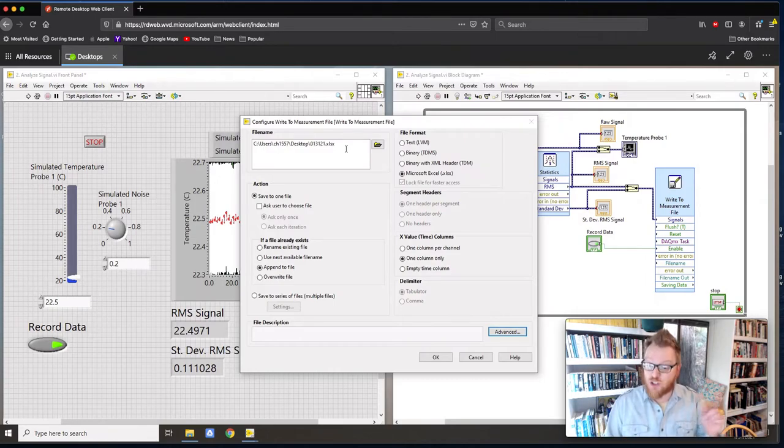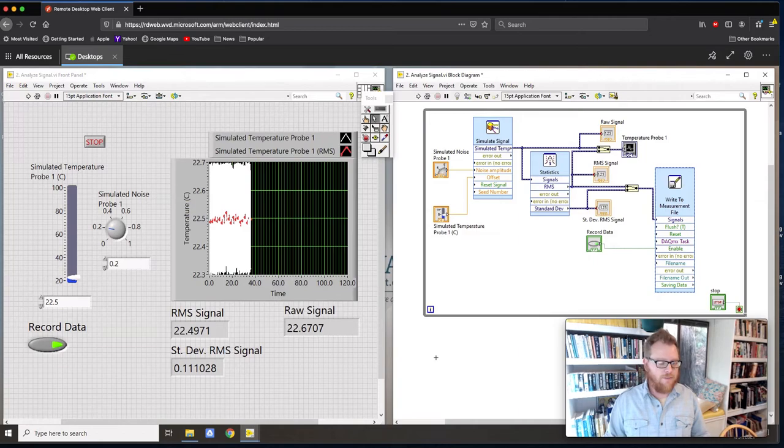I probably should have started there, okay? So I'm just going to keep recording this. I'm not going to edit this mistake out because you'll see how I myself deal with mistakes. Oops, and then I definitely want to make sure, I'm going to push that finger button and make sure that that button is off. Because if that button was turned on, as soon as I start running the file, it's going to start recording.